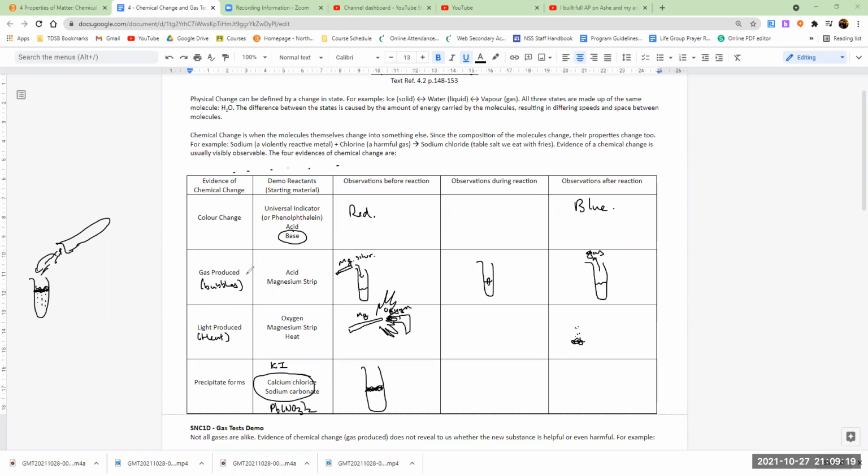And some people might confuse that as a color change because, oh, clear became yellow. But the yellow isn't because the solution itself changed color. We actually produced a yellow solid, yellow flakes. And soon enough, you see these yellow flakes start to sink as if it was a snow globe. It actually starts to sink to the bottom.